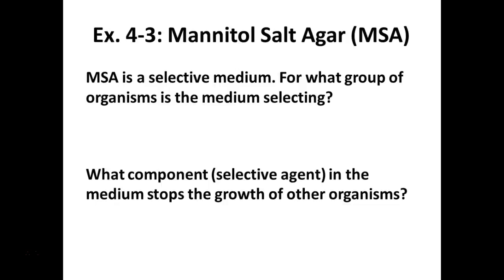So for mannitol salt agar, mannitol is a sugar in its alcohol form. So yet again, we're going to be asking if the organism grows, does it ferment this sugar? But we're going to select for a particular group of organisms with this media. What type of organisms are we selecting for? Typically, with clinical specimens, we're looking for Staphylococcus. But remember, we're not dealing with clinical specimens, pathogens in this lab. Not anymore, anyways. So, what makes this selective, though, for Staphylococcus? What's selective about this media?